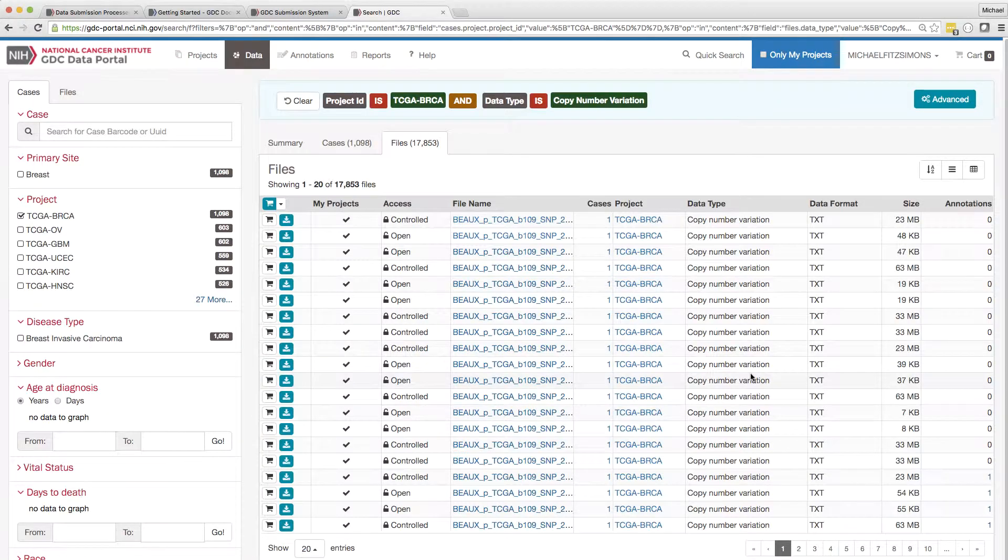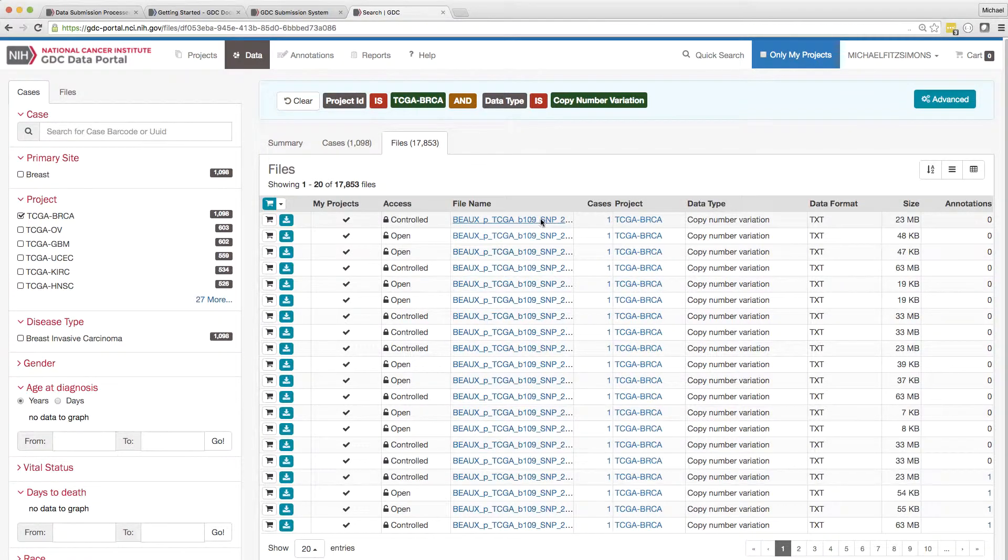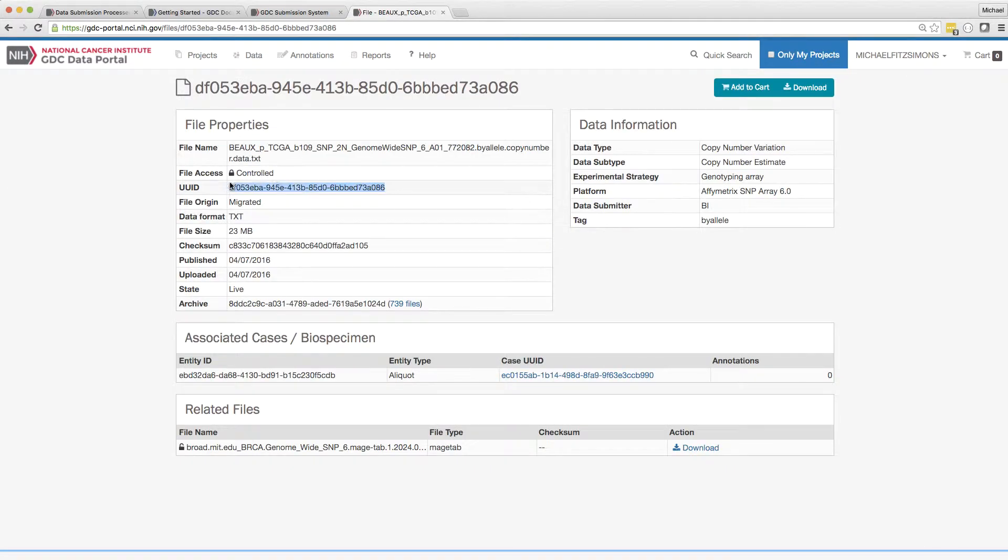Just as with the upload function, you can specify UUIDs directly or create a manifest.